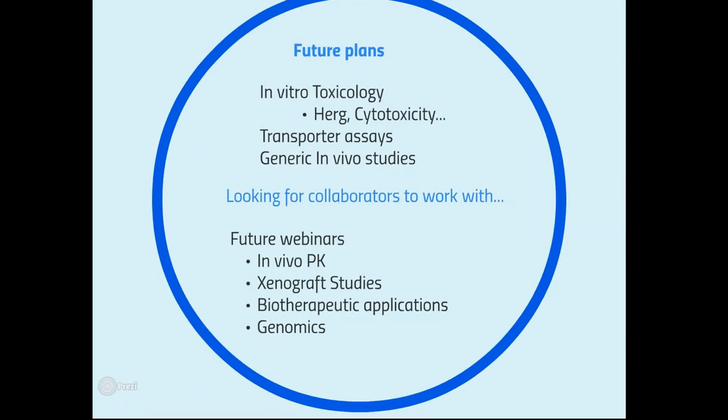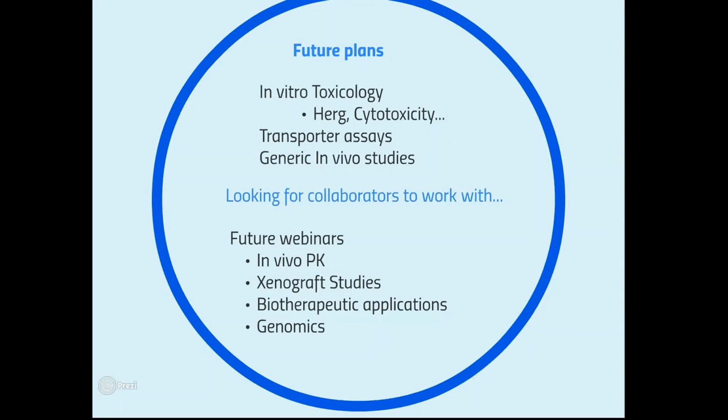Which assay design is implemented in PPB, for example, ultrafiltration or equilibrium dialysis? Input raw data could be different. Yeah, definitely. I can answer this question. In this case, the one I showed you was the equilibrium dialysis. Indeed, we can work with the other assays, and then it's indeed reading from a different raw data file. So sometimes there are some changes needed to the binder, which we can provide. So the next step, of course, is to build an ultrafiltration binder straight for you to use.